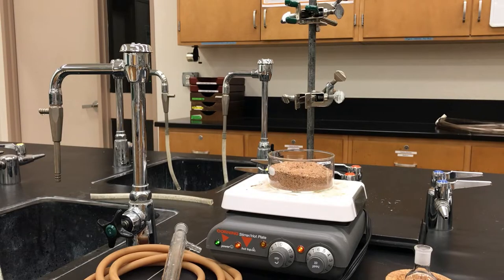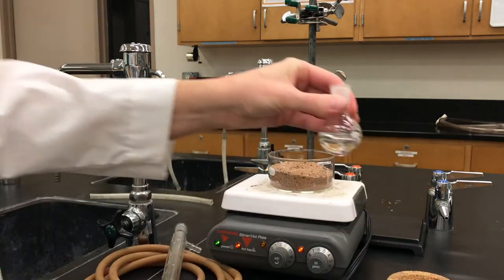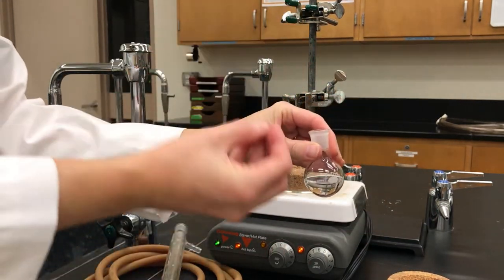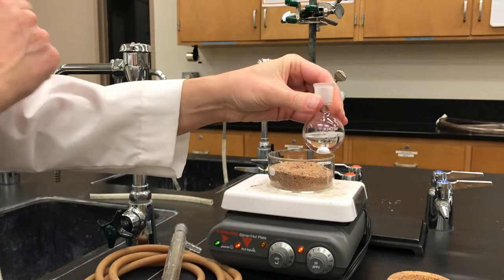Hi, I'm Lisa Nichols, and today I'm going to show you how to set up a reflux in order to heat a mixture. There are lots of ways to heat something, and in this video, I'm going to use a sand bath heated atop a hot plate. To control the boiling, I'm going to use a stir bar, and you put that into the liquid.